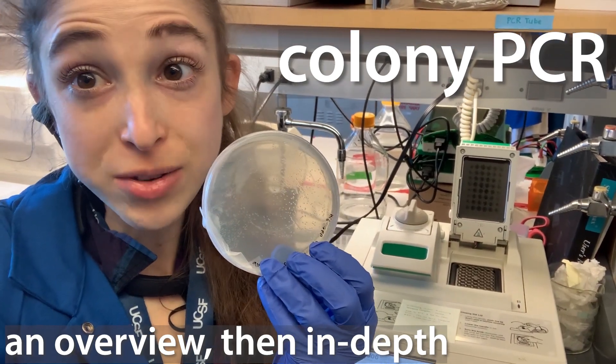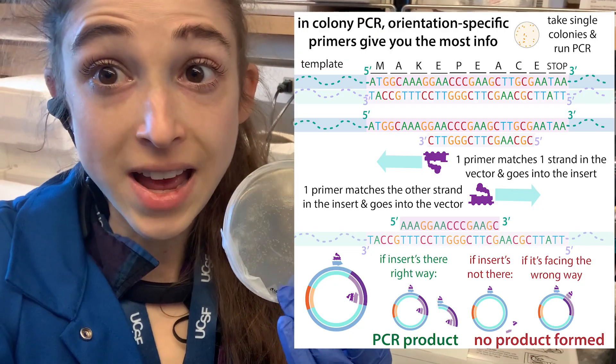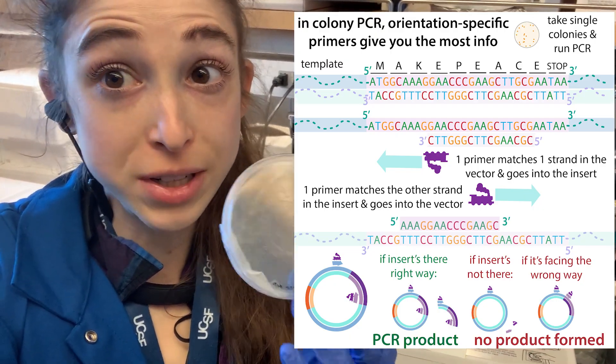Colony PCR is a quick way to see if a colony — one of these little clumps of bacteria — actually has the plasmid that you cloned and that you cloned it correctly.